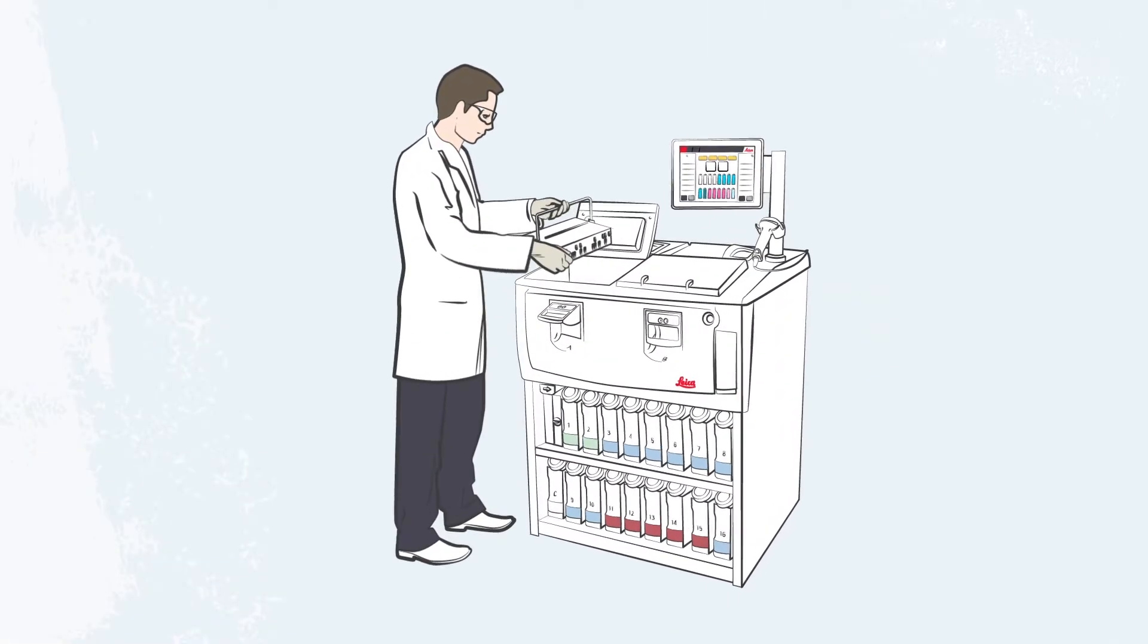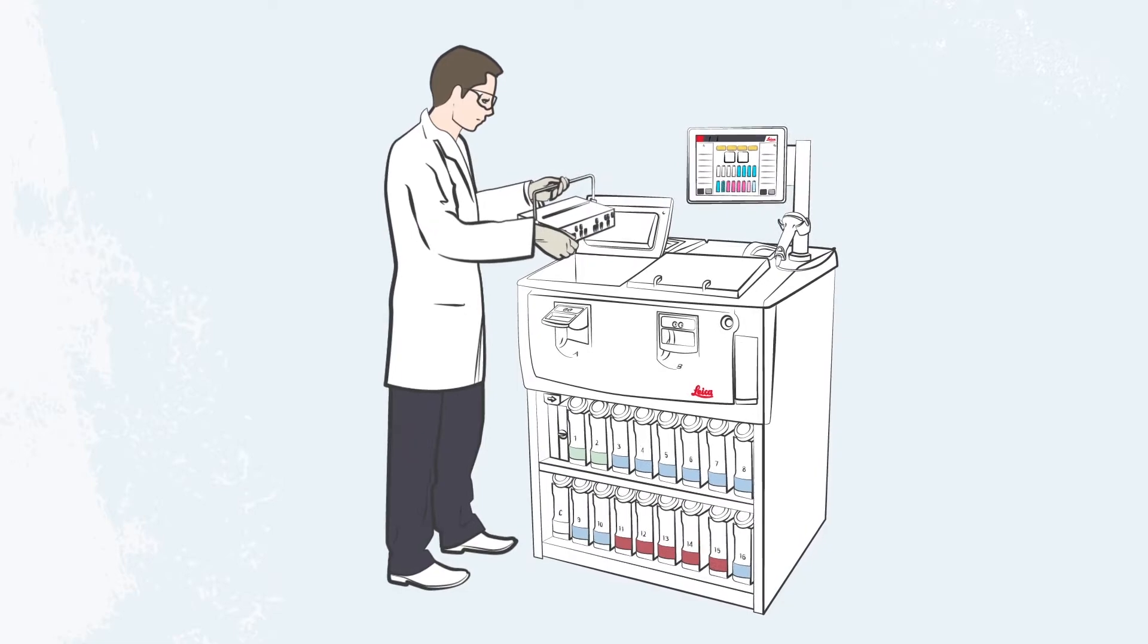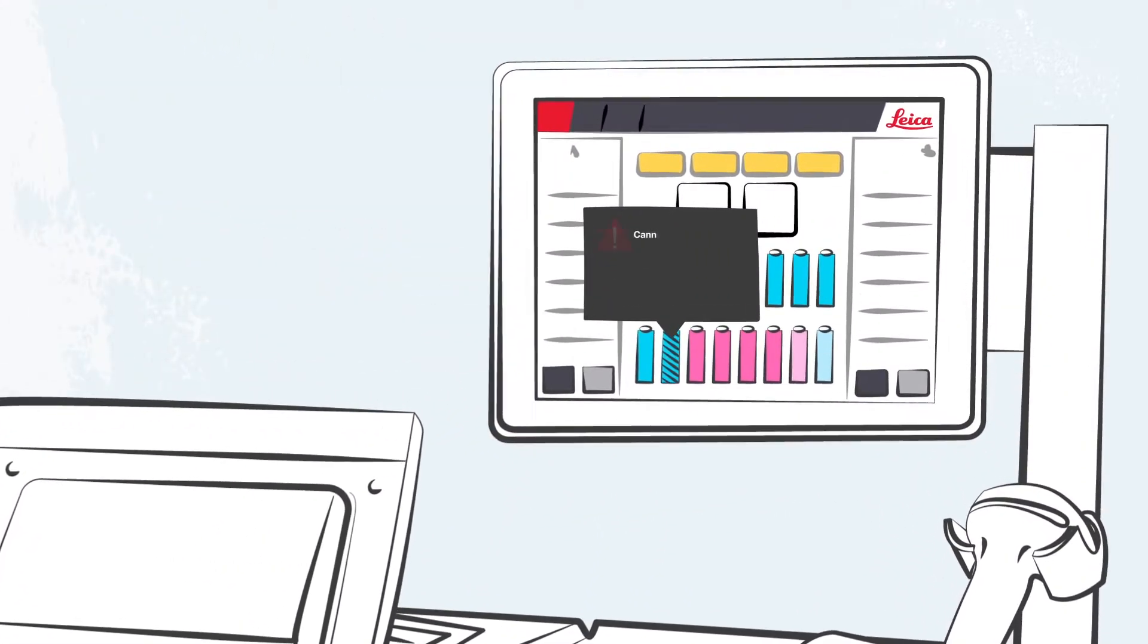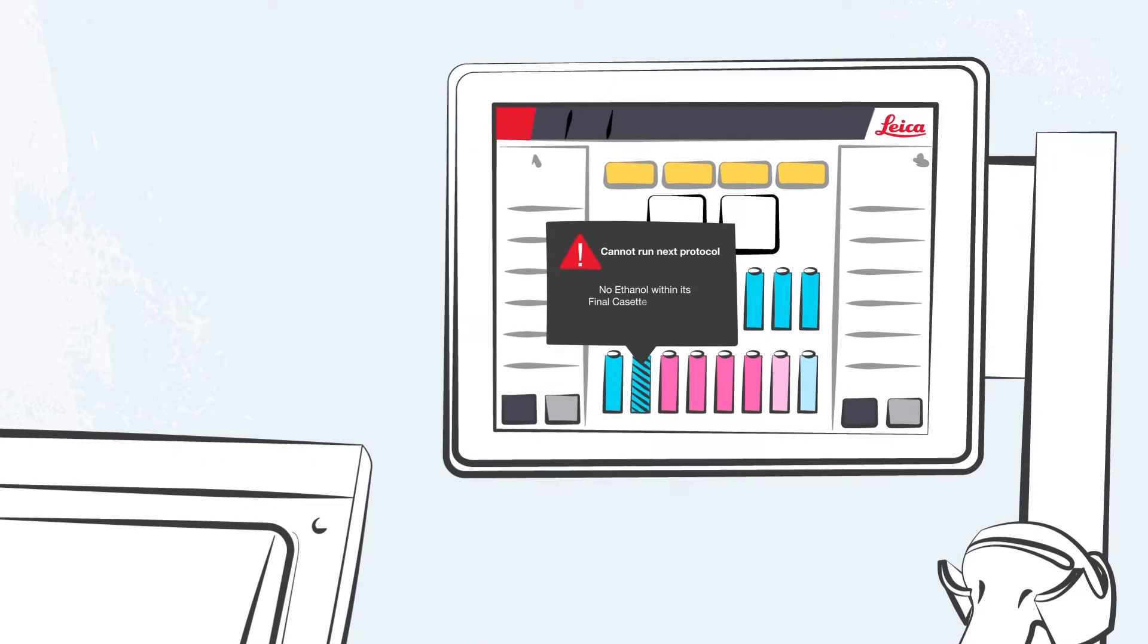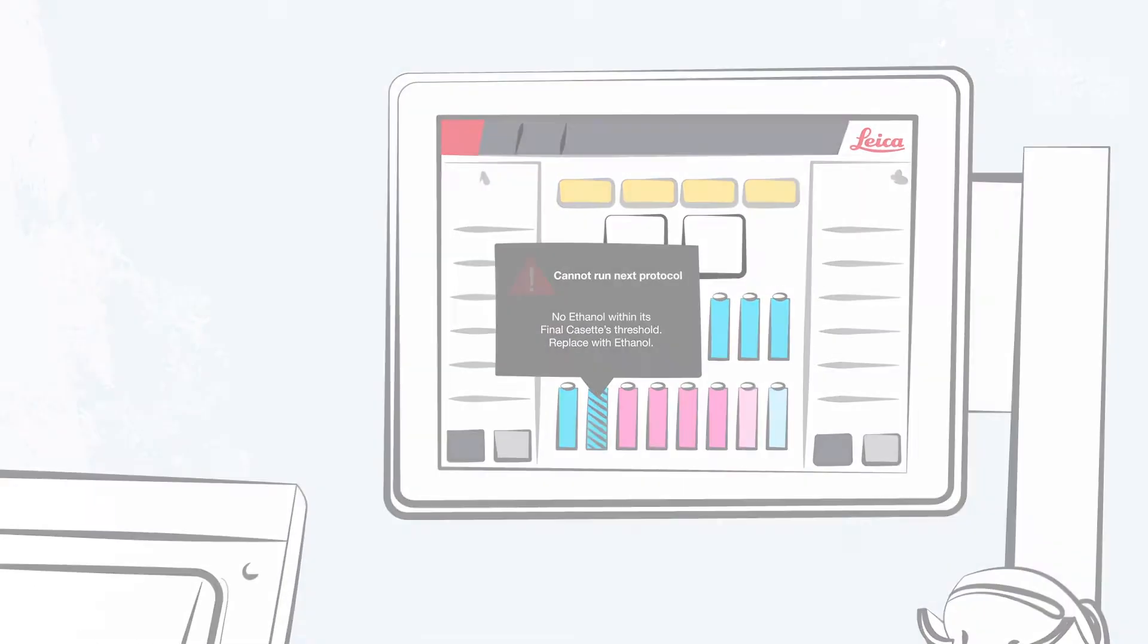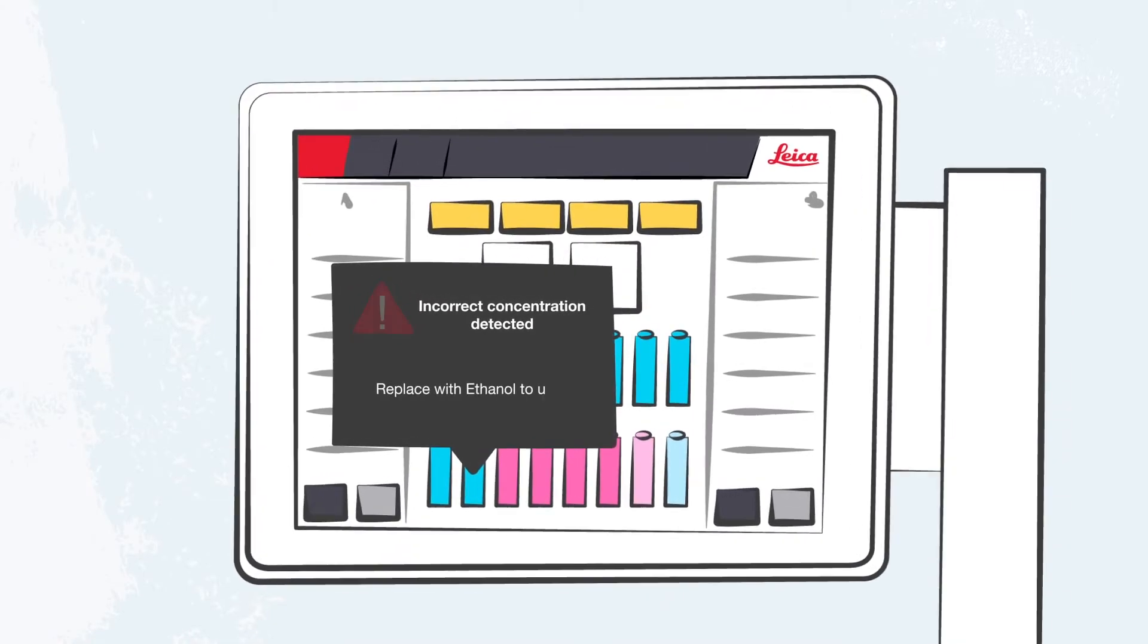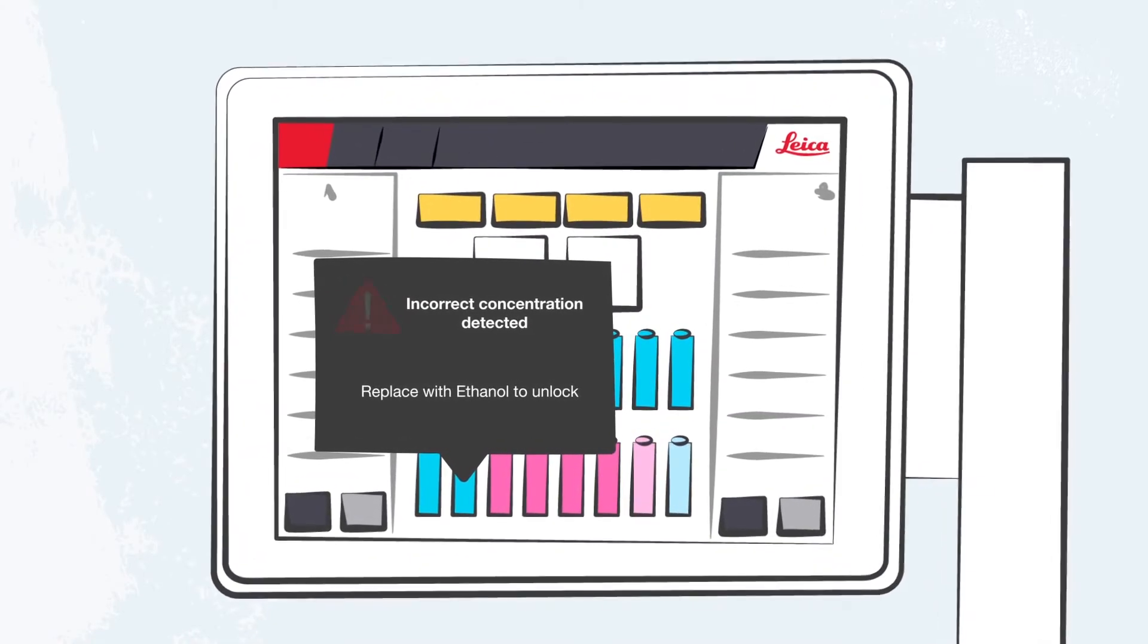Adam begins his shift and the processing run has completed on schedule. The reagent management system indicates a required exchange of the 100% ethanol since the density level is below the limit. Polaris 3 detected a concentration of 70% ethanol, not the required 100% level.